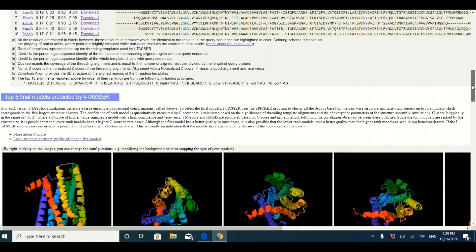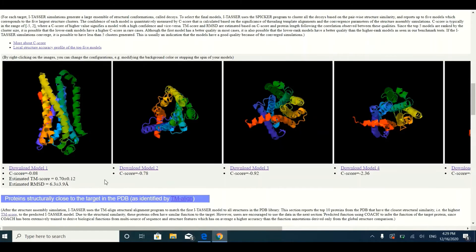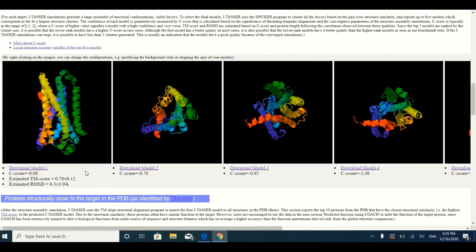After the template section, you will see the three-dimensional structure models of your protein. I-TASSER normally predicts five models, though sometimes it may give you three or even one model. Among these models, you choose the most appropriate one. Models are selected based on the C-score — the higher the C-score, the better the model. However, C-score is not the only criterion; there are other factors as well which will be discussed later.